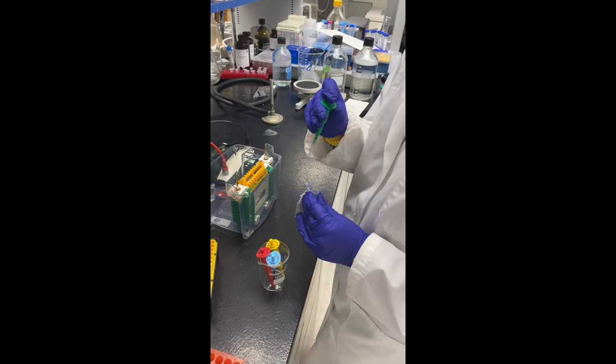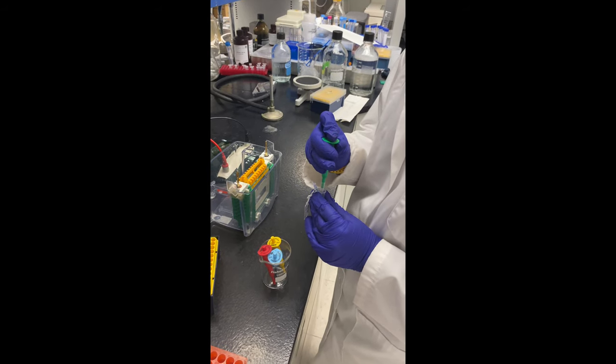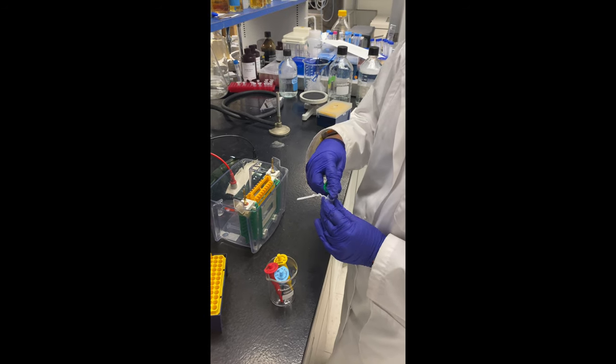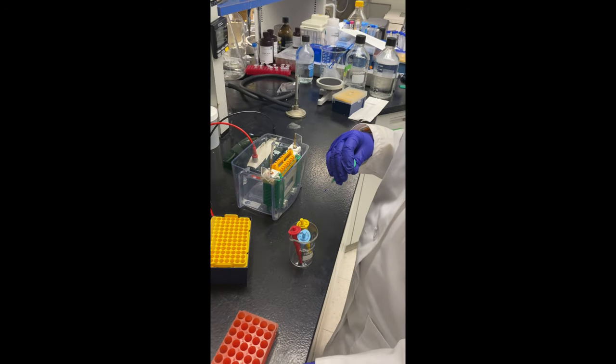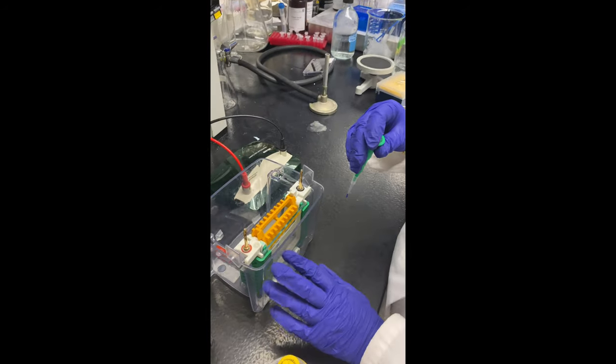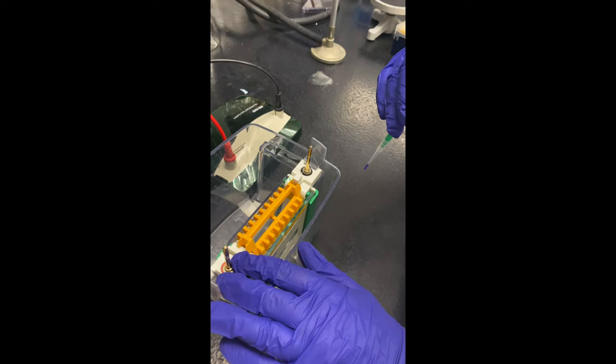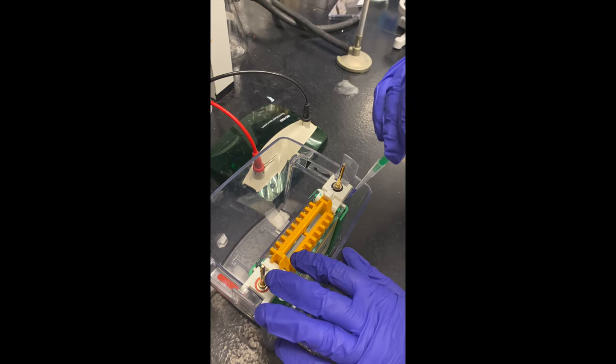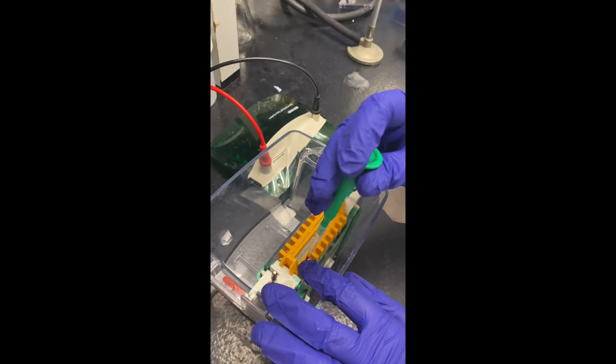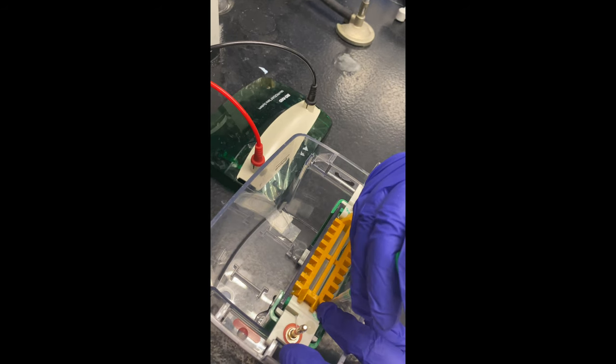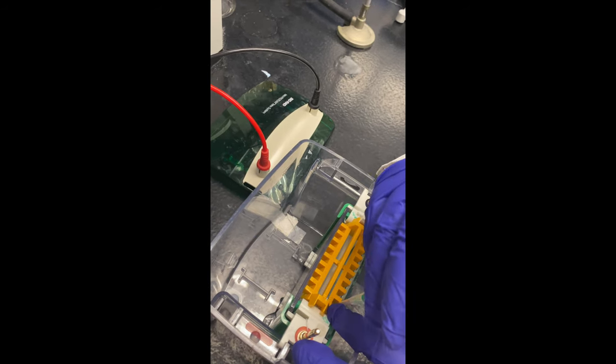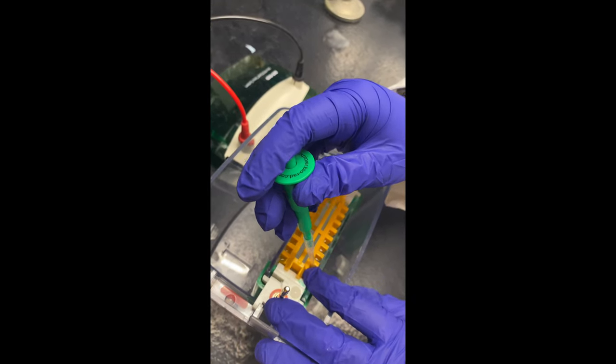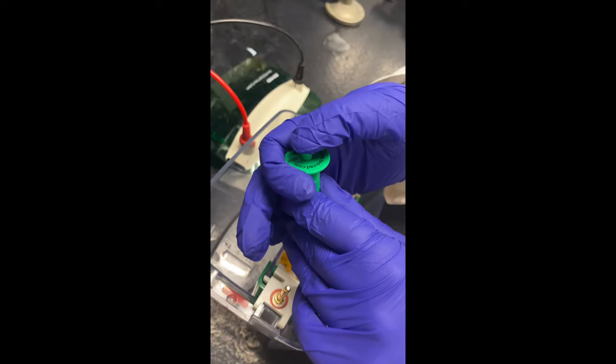The SDS loading dye has a chemical called BME in it and it smells bad. So just close that cap. And then you can feel the gaps in the loading guide for the second lane. And then stick the tip in and wedge in between the two glass plates and angle it a bit too, so it is in the right area. You got it, Emmy. And slowly depress the pipette button.